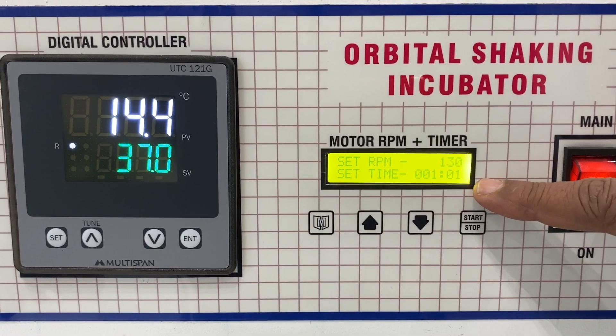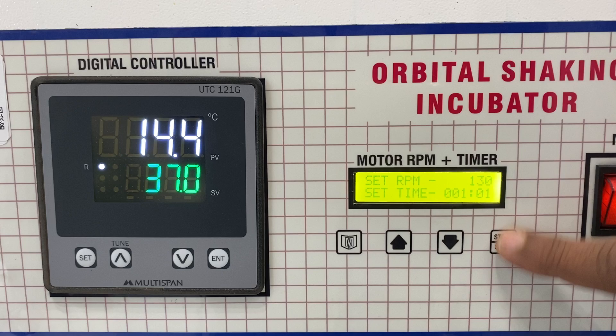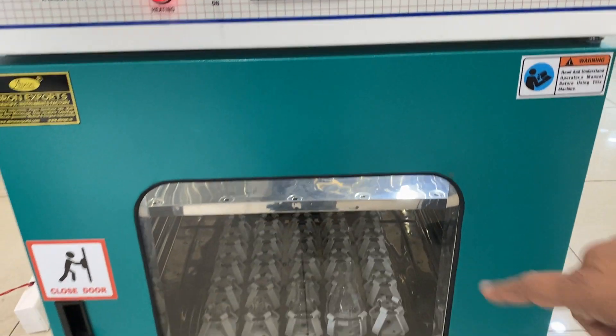All settings are done. It tells you 'program successfully set' — 130 RPM speed and 1 minute and 1 second timer is set. Now you can start.